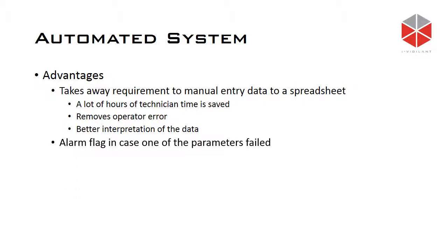The other advantage of the automated system is that we can actually flag an alarm automatically in case one of the parameters fail. And then also we have all the historical data at our fingertips, because every single data point is actually saved in the database.